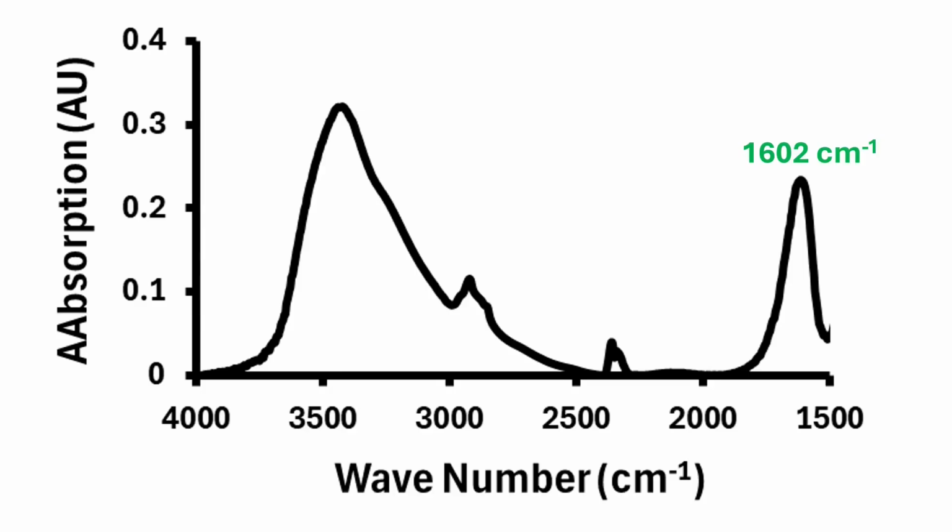Presence of a carbonyl, carbon-oxygen double bond, peak around 1650 to 1760 centimeter inverse would suggest an amide or a carboxylic acid. An FTIR band at approximately 1602 centimeter inverse typically corresponds to one of several functional groups, and the most common ones are discussed in the next slide. The exact assignment depends heavily on the molecule being analyzed and the overall spectrum. What are the possible sources of this band?